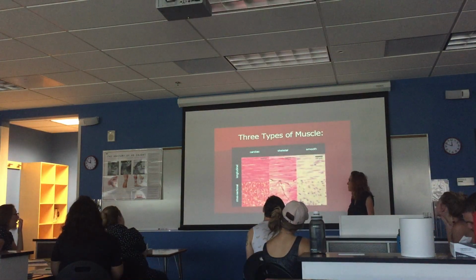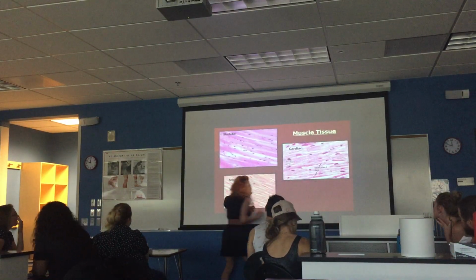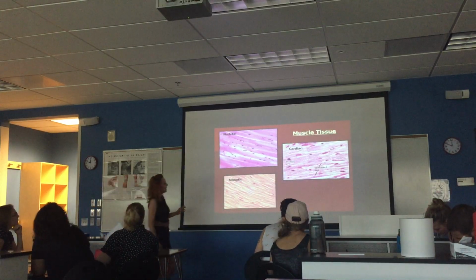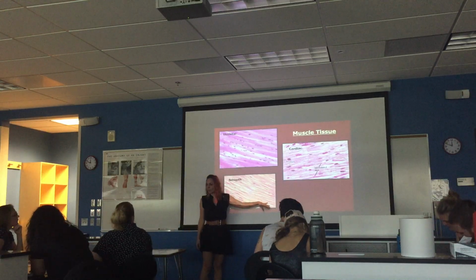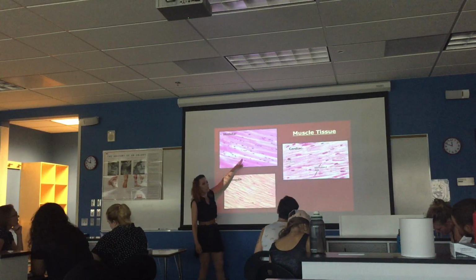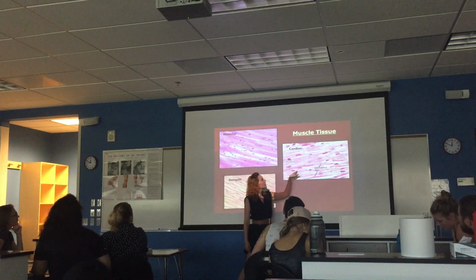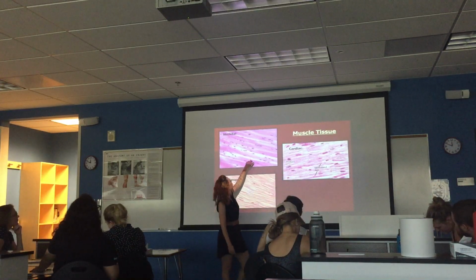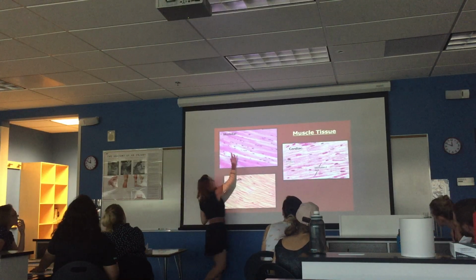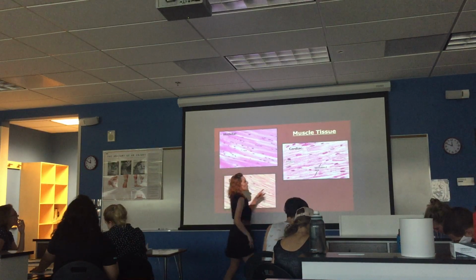Muscle comes in three types. Histologically, it's going to look a little bit different. Smooth muscle is going to be the one that looks a lot like dense regular, because it's nice and wavy and parallel. And it doesn't have what the other two types of muscle have, and that is striations. You can see, if you look real hard, there's little shadow stripes on this cardiac muscle tissue and this skeletal muscle tissue. See those? Like the fibers are running this way, which is great. They're multinucleate, but then there's little tiny shadows or striations.